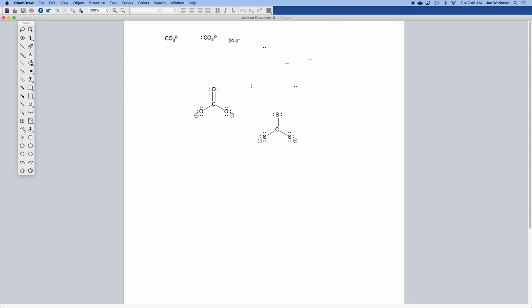That automatically changes the label. Now I can move this around if I wanted to, or I can type Command C if you're using a Mac, and that's now copied this to the clipboard.